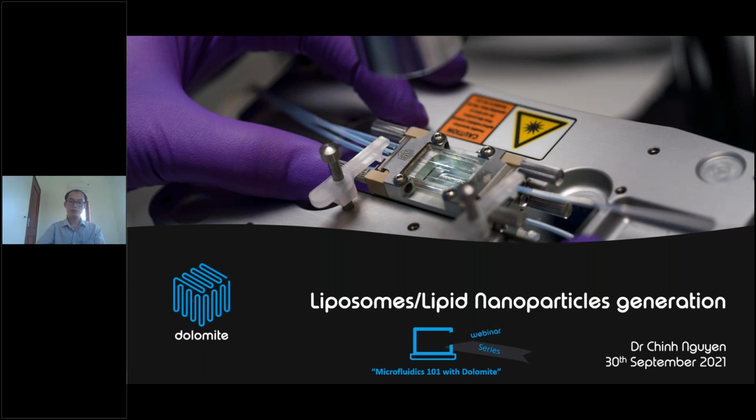Today's webinar is one of the webinar series we call Microfluidics 101 with Dolomite. This is delivered every last Thursday of each month throughout 2021. Today's topic is that we will learn about liposome and lipid nanoparticle generation.